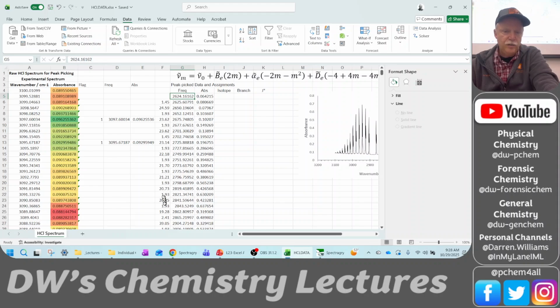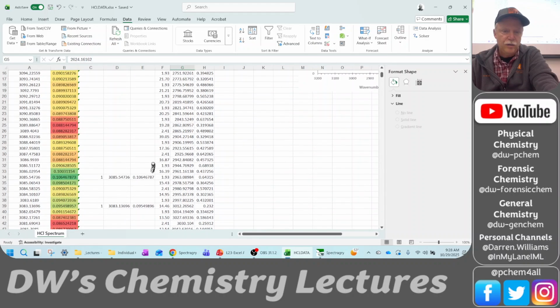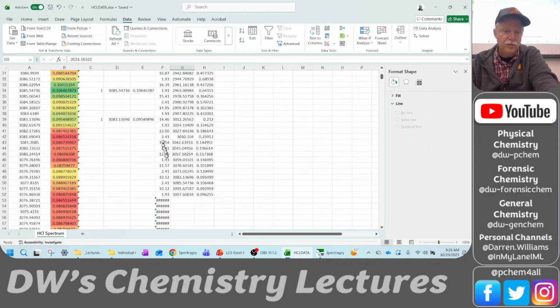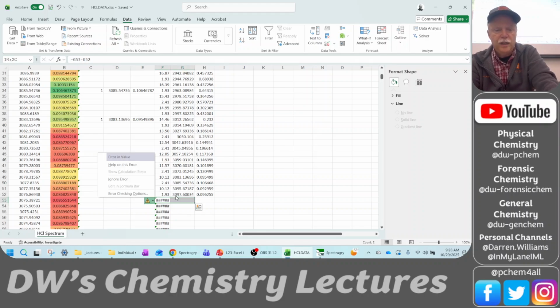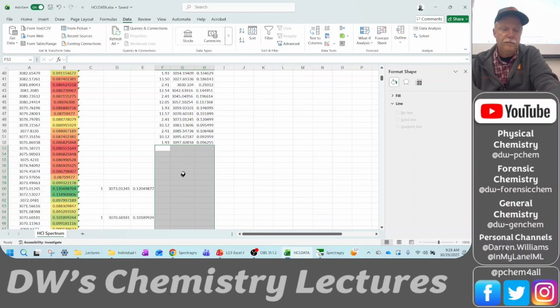22 and 1, 22 and 1. It goes down all the way. Here we have a big gap. Okay, that's probably our Q branch. Okay, we'll have to check that. You see, it's no longer quite 20, but it's still sort of a consistent pattern. I'm going to go ahead and take all of these guys right here and delete them all the way down, and that'll clean all that.